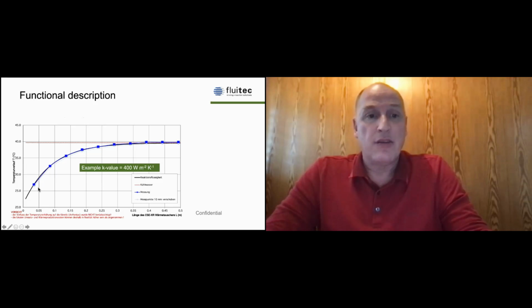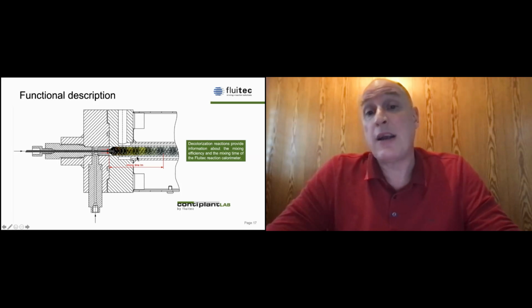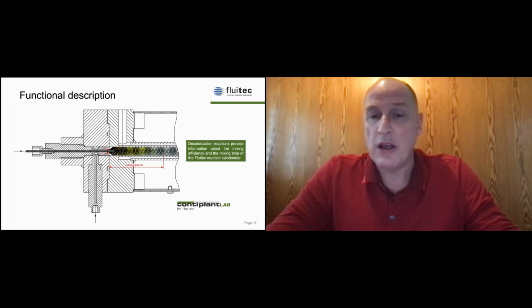We also did quite a lot of research on the mixing time, because mixing time is always an issue. It has an impact on the reaction. I will show that later on. The way we did it in the last couple of years was always with decolorization reactions, and we have good knowledge in calculating the mixing time, the homogeneity, the macro and the micro mixing. I'm sorry.